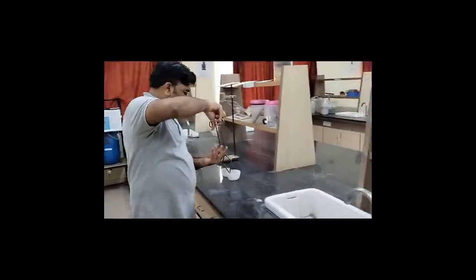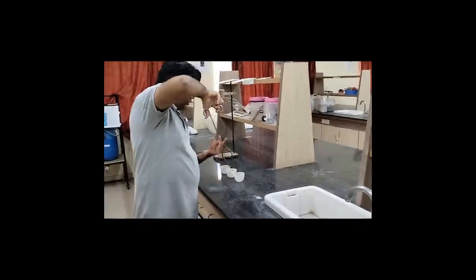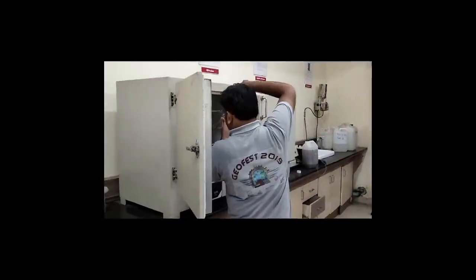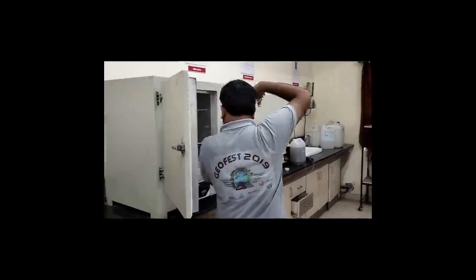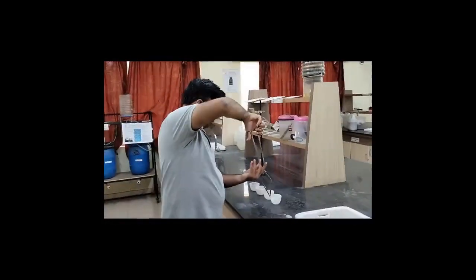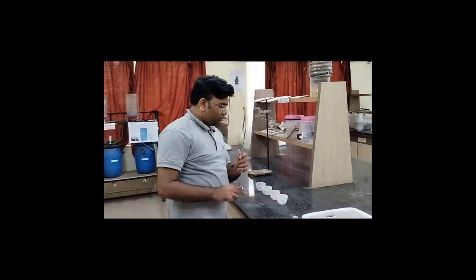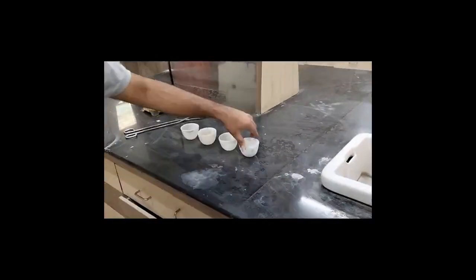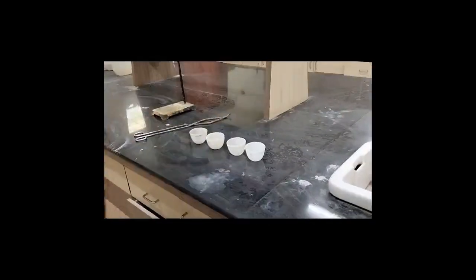We normally keep them in a desiccator, but we are not going to keep them in a desiccator, and we are going to immediately take the weights of these crucibles. So we will keep them for some time to cool, and then we are going to take their final weights. Right, so we have A, B, C and D crucibles with us.